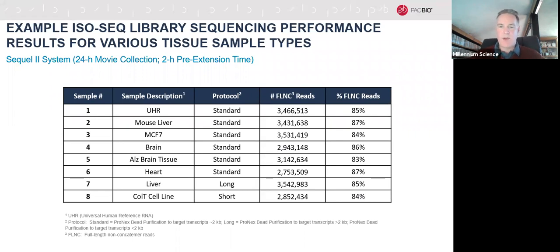Just note that when you do the shorter molecules, the number of filtered reads you get here is a little bit less than the average, but that's just part of going for the shorter sequences.